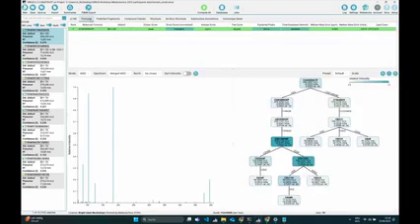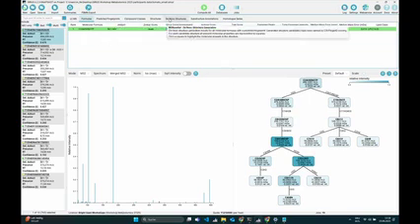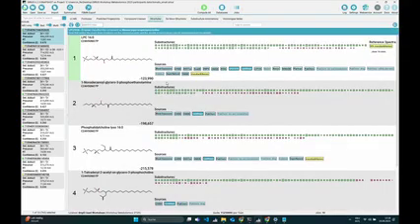The only thing we do is that by the rule-based lipid annotation, we will find a single formula that works, so we do not have to rank multiple formulas anymore. Then we take this formula and run CSI FingerID. It will show you the lipid class detected up here.